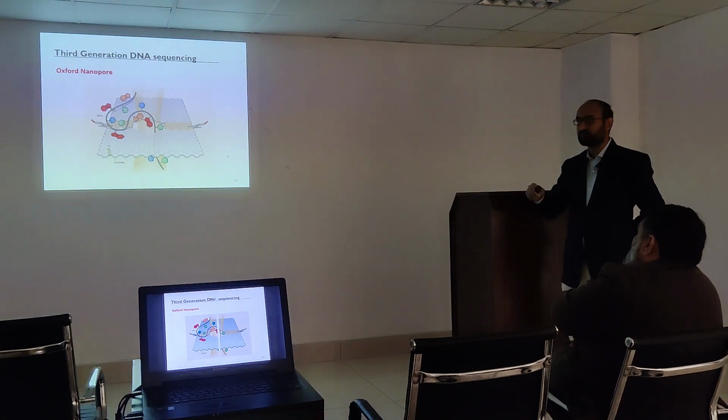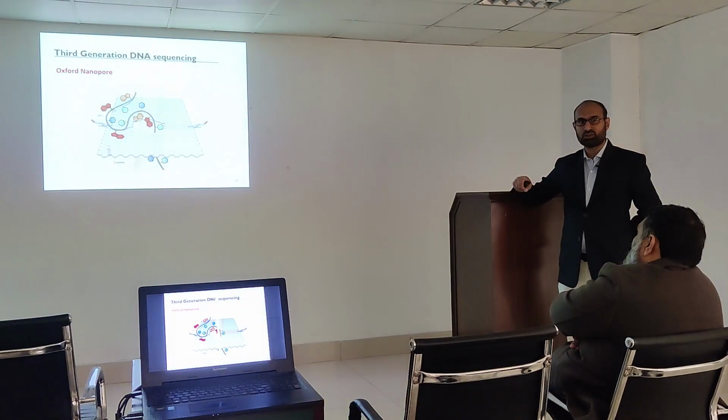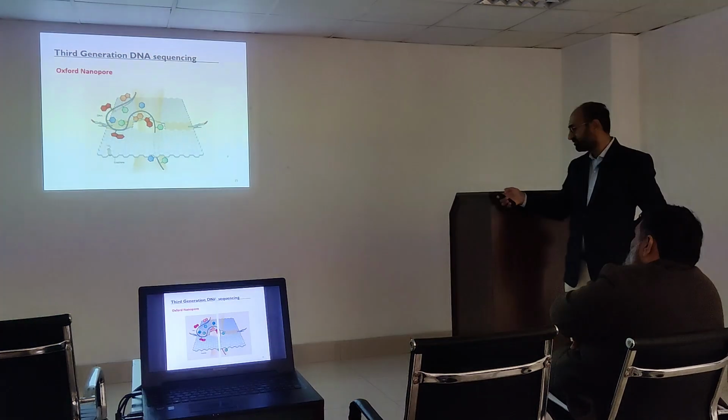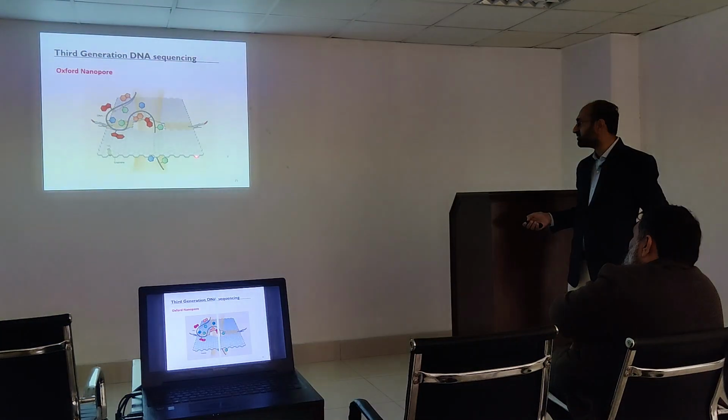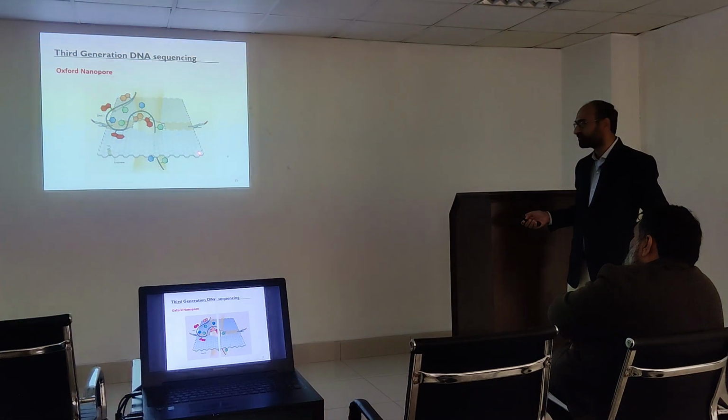Through each receptor, a different DNA fragment is passing. So the machine is recording the sequence of each receptor simultaneously. Imagine this is a circle or some other shape, and one shape represents one receptor. You can count how many receptors are in one row and how many in one column.